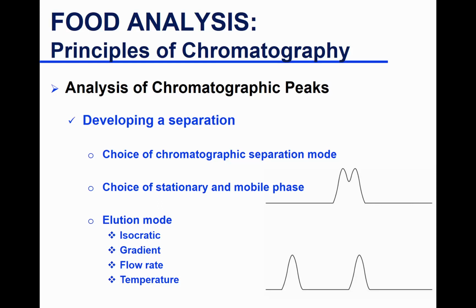Again, I'm just introducing the principle, but later in the semester we're going to get examples of different stationary phases and mobile phases for different compounds that we're going to analyze. And then you go, okay, I'm developing this method. I ran whatever is published in this paper. I followed the exact same mobile phase constitution.